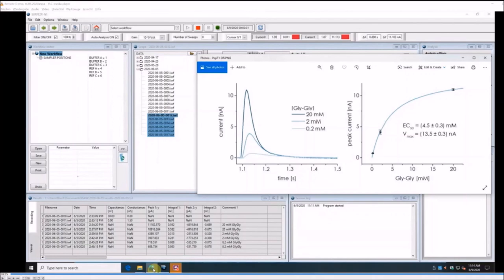However, we cannot do this during an actual measurement because, for example, in the conductance measurement, maybe you remember how the current shape looked. We had this huge upstroke and then slowly getting back to a certain value. So if we did a voltage jump during a measurement, the same would happen. It's extremely difficult to hold it at a certain voltage. Technically it would be possible to apply voltage, but it's basically not possible to fix the voltage at a certain value. Even transport activity would then again influence voltage and so on. So it's tricky. Of course, we thought about that, and maybe at some point there will be a technical solution. But so far, it's not possible to apply a voltage step during a measurement.